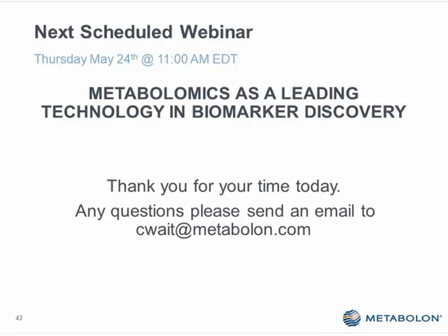part of our library are molecules that we've measured over the last 10 years or so, but we've still not identified what they are. They have all the characteristics of a chemical standard, but we haven't necessarily identified what the molecule is. 13 years ago, when we started doing this, the vast majority of the molecules were these unknown molecules. Today, it's relatively small. It's probably less than 20%, in many cases 10%, of the molecules we're measuring in this space. And we elucidate about 50 to 100 molecules a month.